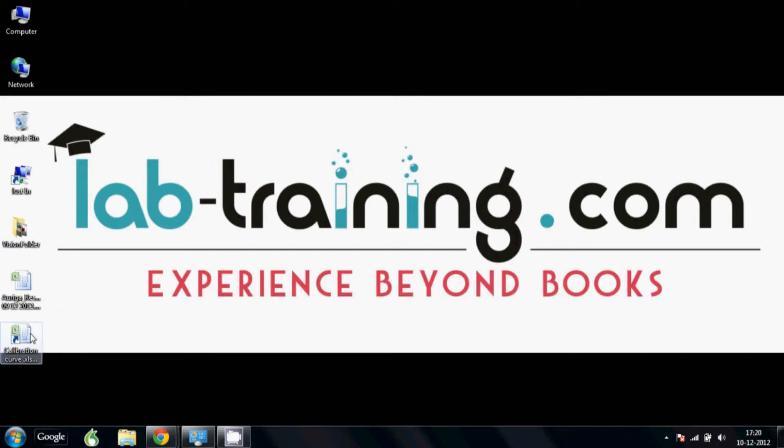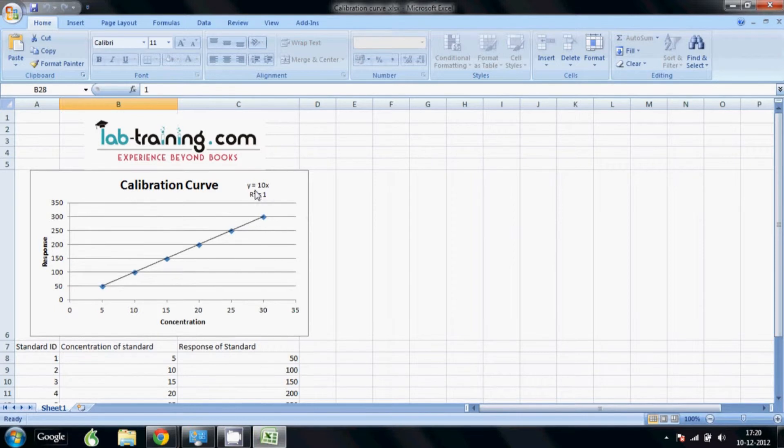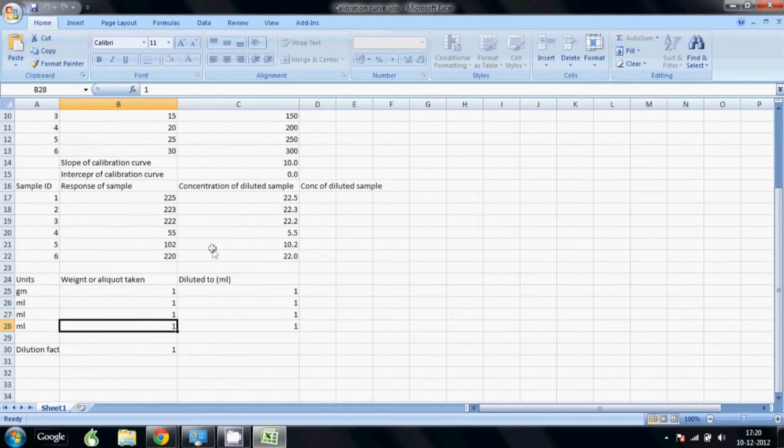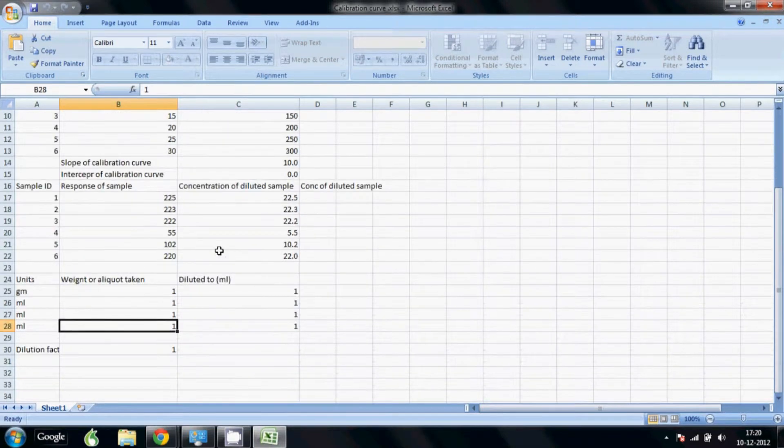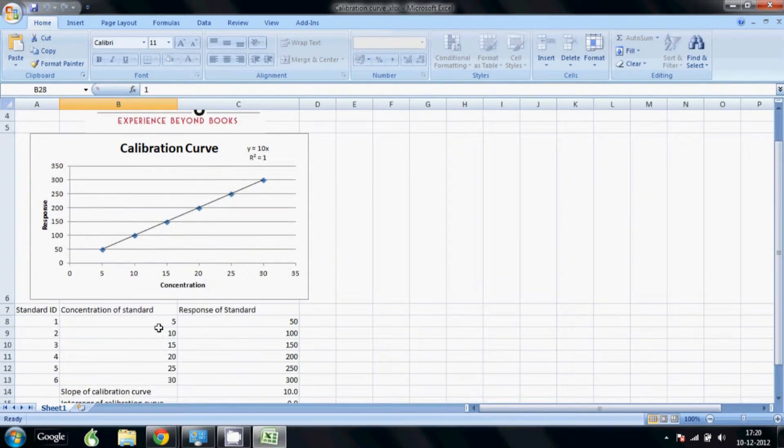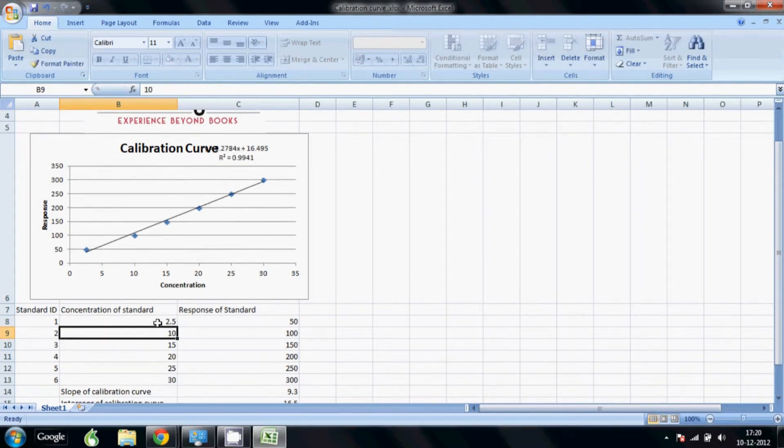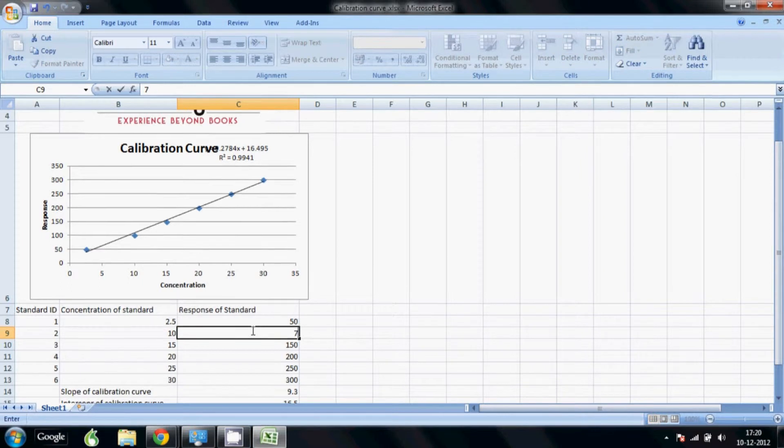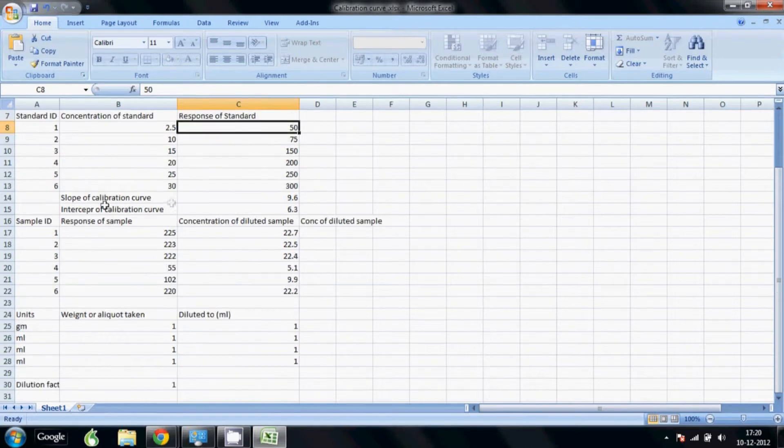So I'm actually going to show you the end product before we start. This is the kind of Excel sheet which we will be making. It will give you a calibration curve with the equation, the r square value, and it will be protected so you can see when I click I'm not able to select any of the data, but I can enter my values here for my calibration standard concentration, the response that I have got, and accordingly the data gets updated in real time. From this it calculates the slope and intercept required for calculating the concentrations of the samples.